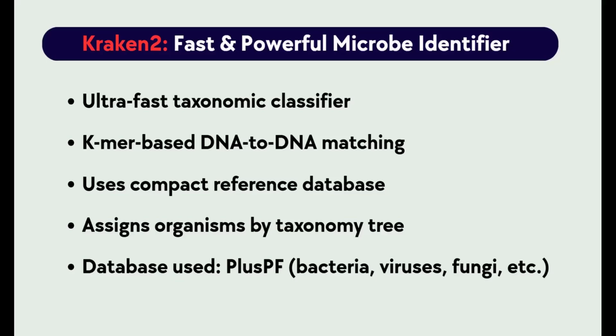And speaking technically, we have mentioned that Kraken2 works by breaking down DNA reads into short fragments called k-mers, and these k-mers or fragments are then matched against a vast database of known organisms. Also, we have mentioned that Kraken2 is super fast and maps each match to the most likely position in the taxonomy tree. These tools give us a quick, comprehensive first look at the microbial life in our sample.